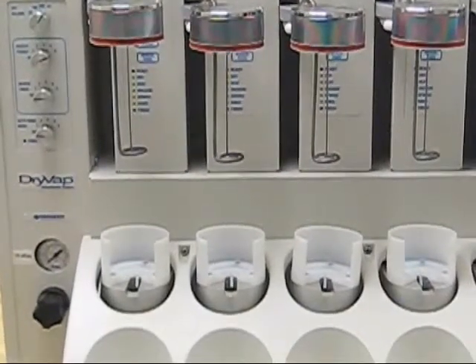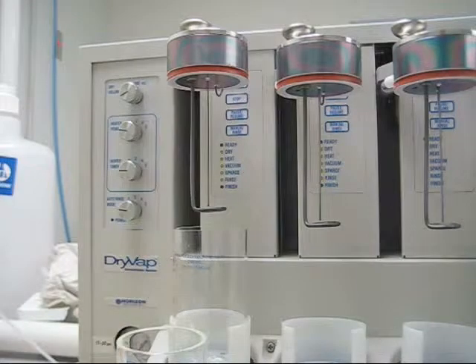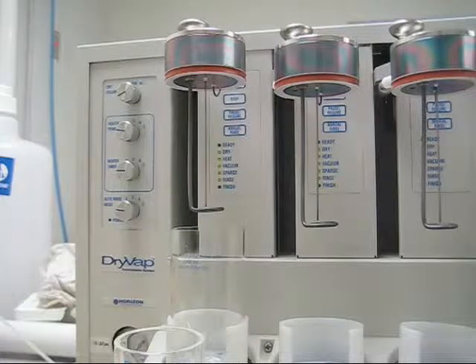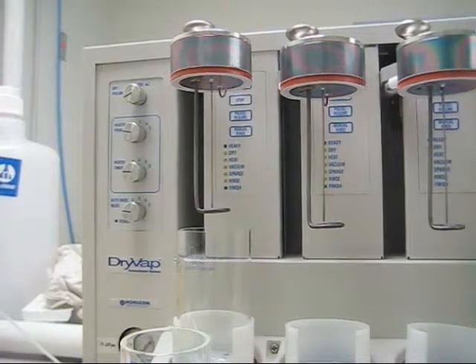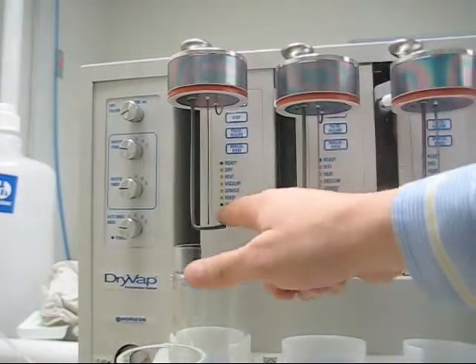Next down is the heater timer. You can actually go ahead and time how long you want to have the heat on. Now we're just going to take a closer look at one of the individual stations. You can take a look at the station itself or the heater assembly itself, which is right here.